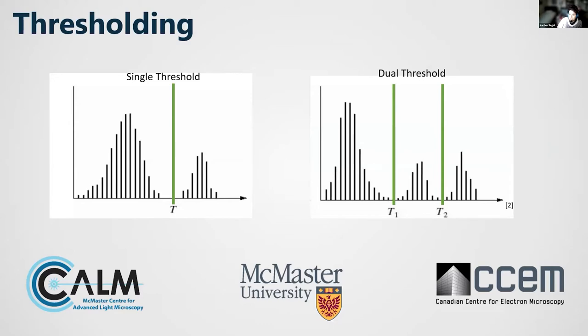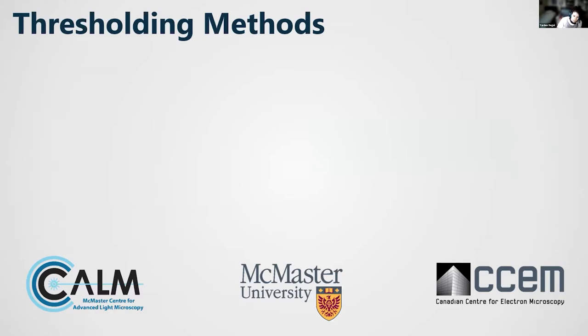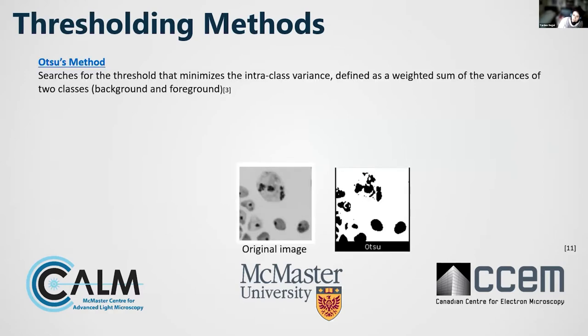There's also entropy, clustering, spatial, and a bunch of other different types of thresholding. But I believe what we'll be looking at today is mostly histogram. So we'll be going through a couple of thresholding methods.